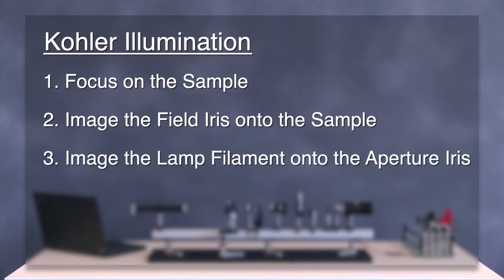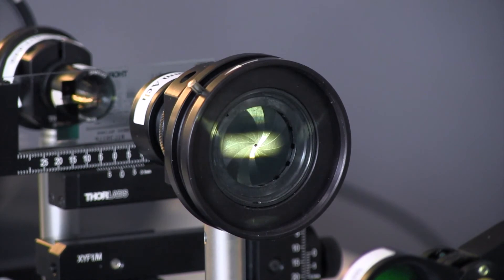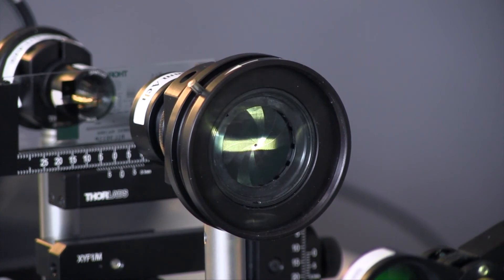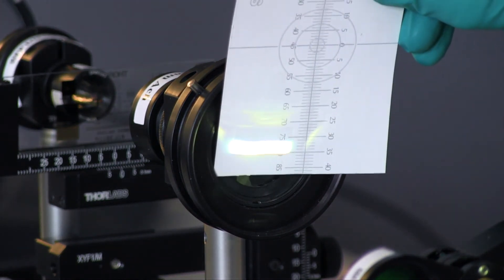The third and final step is to image the lamp filament on the aperture iris. Open the field iris and move the collector lens back and forth until you can see the filament centered in the aperture iris. You can put in the green filter for better visibility. It is also helpful to use a card in front of the aperture iris to see the filament.